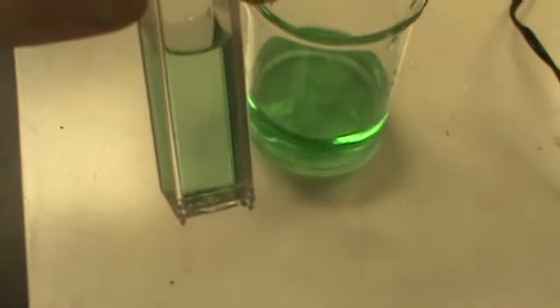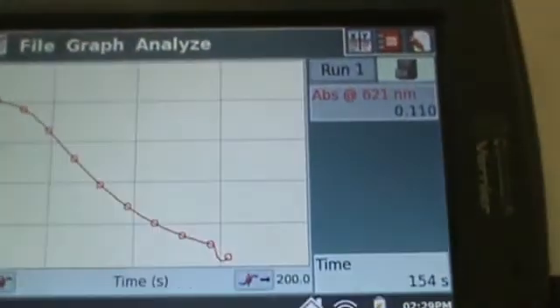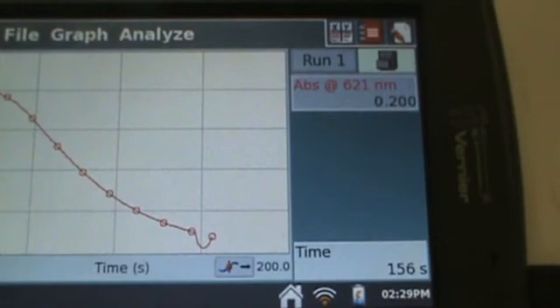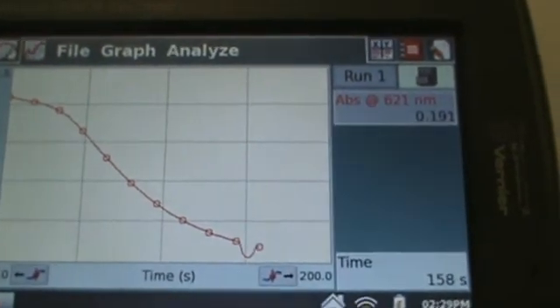Here is our cuvette at that point. You can see that the same reaction is happening in both. And if we stick that back in, that should go back to normal.